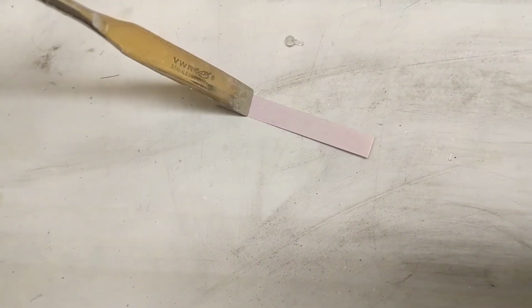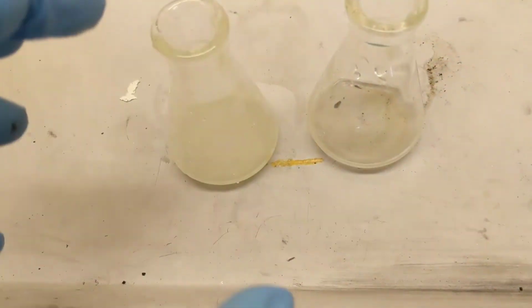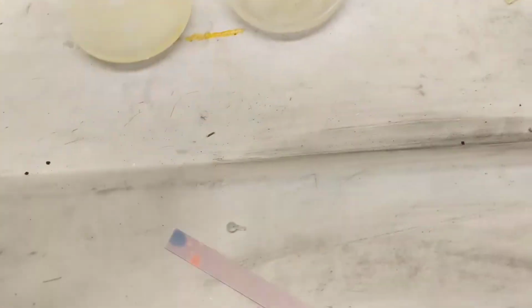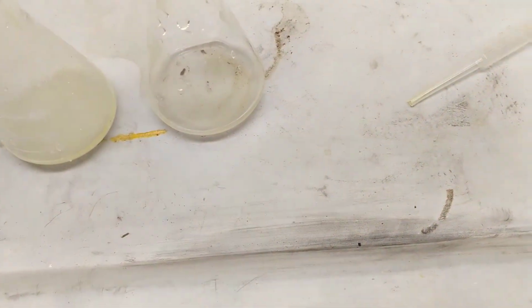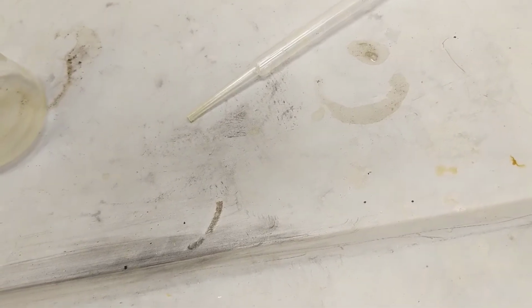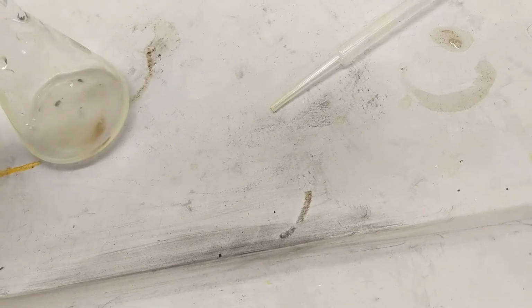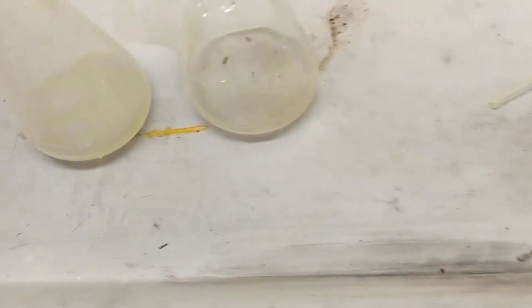Alright, now we're going to check the pH. Light pink. There we go. It's acidic, and as you can see, especially comparing these two, you can see more precipitate cloudiness in this one than in this one. So let's check the second extraction now. Okay, I'm going to add about 2 milliliters of the 6 molar hydrochloric acid. As you can see, not a lot in there.